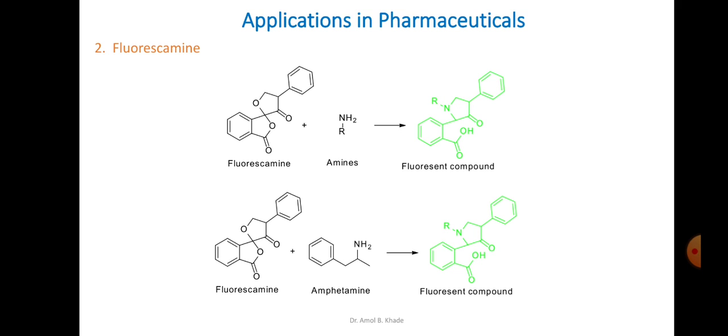So one such example you can see here, amphetamine. Now this amphetamine can be easily reacted here with this reagent, and then we get the corresponding adduct or complex. So you can see the ring has opened here, it is forming a carboxylic acid, and the nitrogen has substituted the oxygen of this particular spiro ring, and then the fluorescent compound has formed which you can quantify.